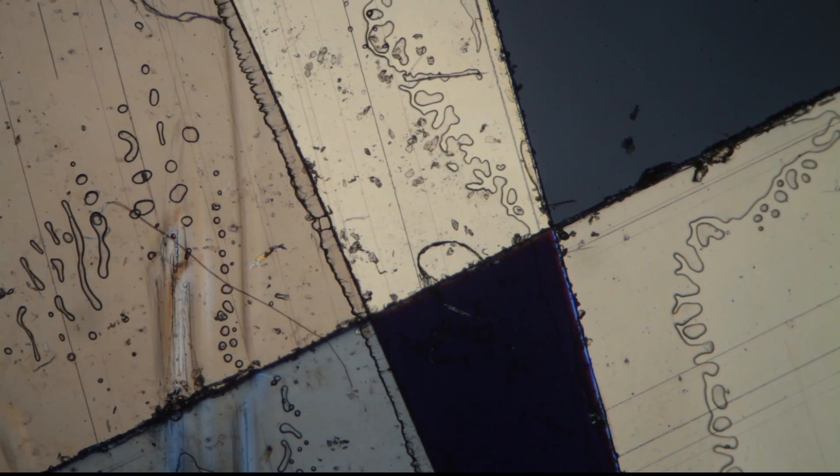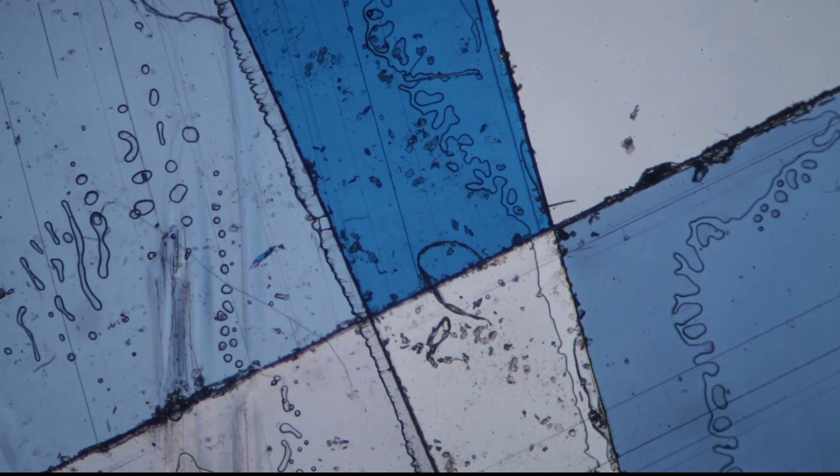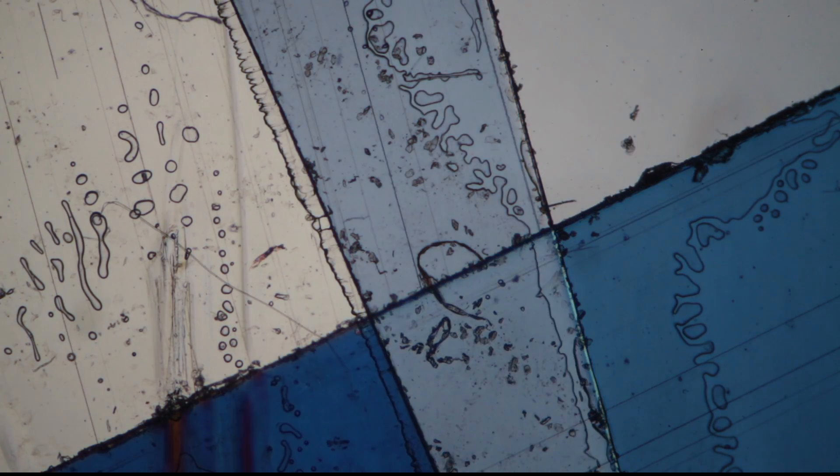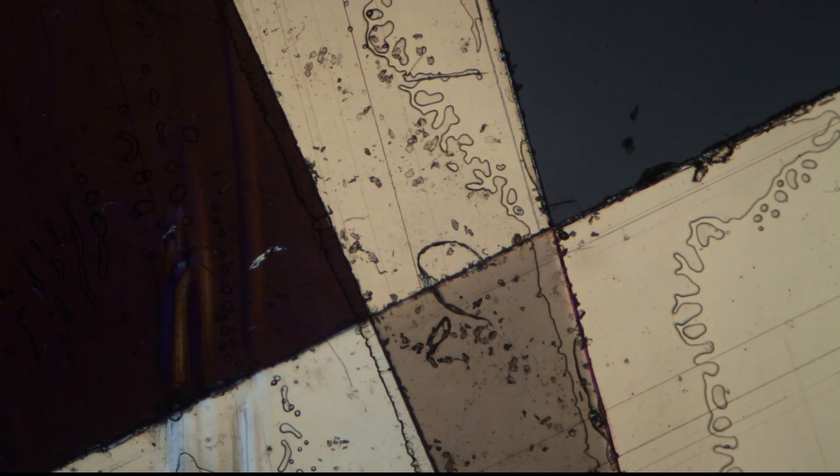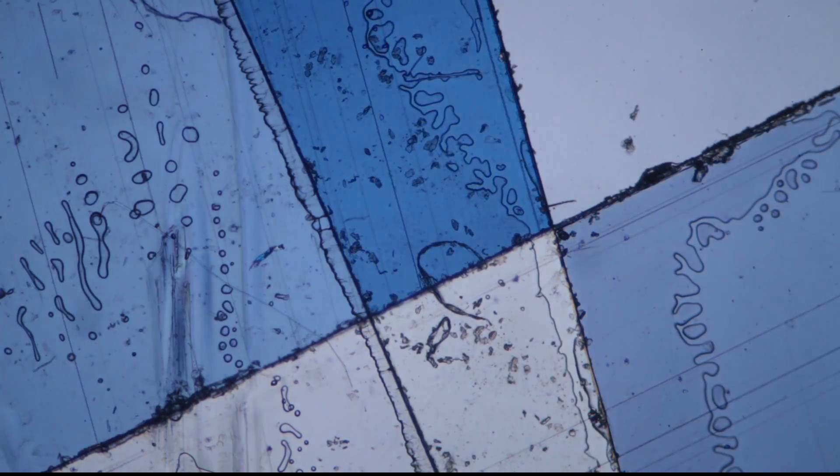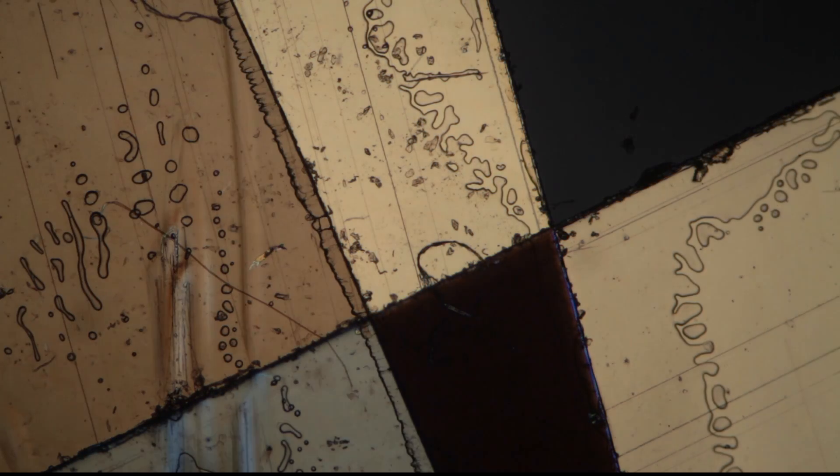And this is the tape now as it appears using my four times magnifying objective. You can see a little bit from the dirt that I'm rotating the filter right now. There's a little shadow on the filter and this is visible as a slight dirt that's starting to turn. And yeah it looks quite nice.